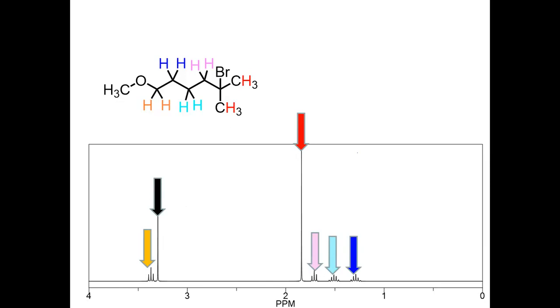And then now let's look at, go ahead. Does somebody have a question? So there were 2 singlets, but based off of the fact that it was connected to an oxygen, you chose the one more downfield. Downfield, yes. Okay. All right, good question.